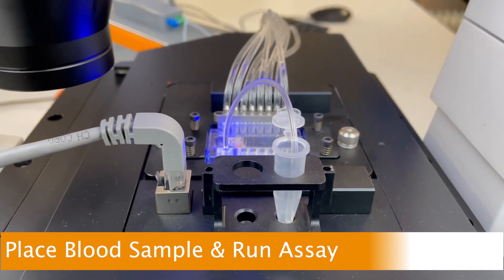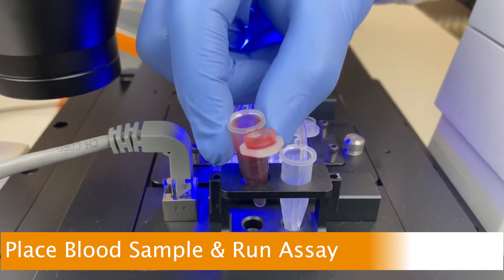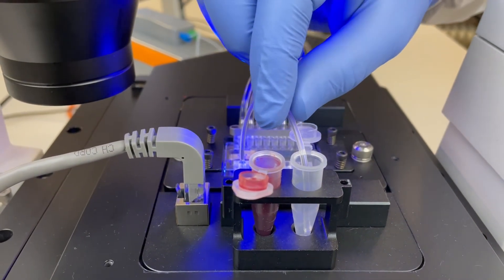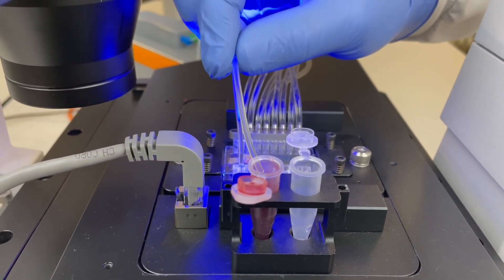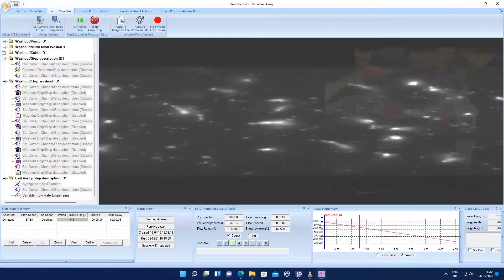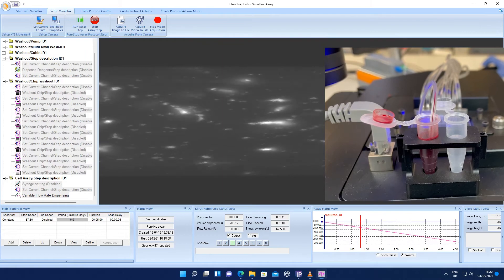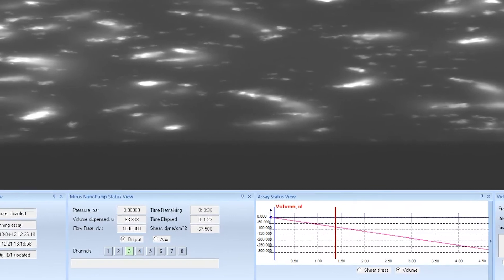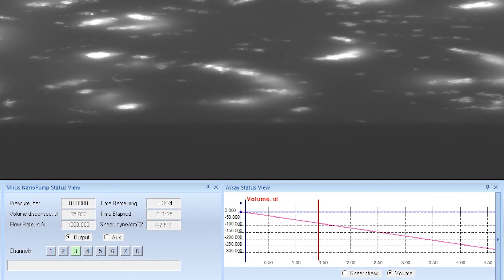Once the settings for the assay have been input, the blood sample in the Eppendorf tube is placed in the holder as shown. The output tube from the chip is placed in the blood sample and the command is given to run the assay. Thrombus formation can be seen in the channel of the biochip as shown. Parameters of the assay can be viewed in the Pump Status View pane or as a graph in the Assay Status View pane.